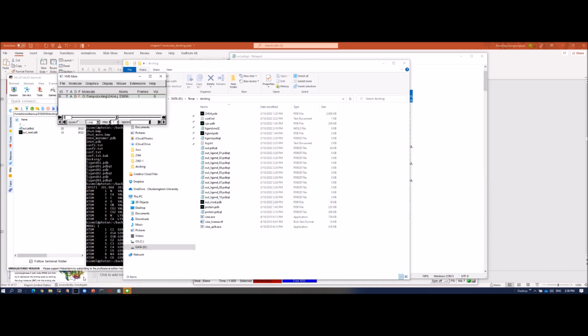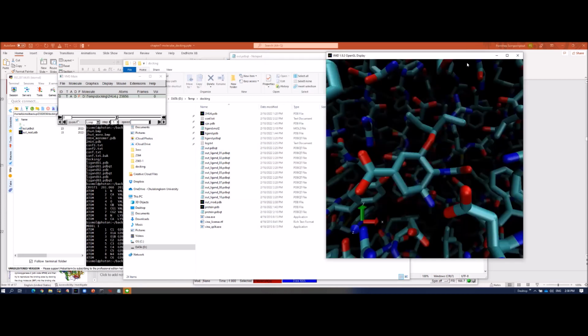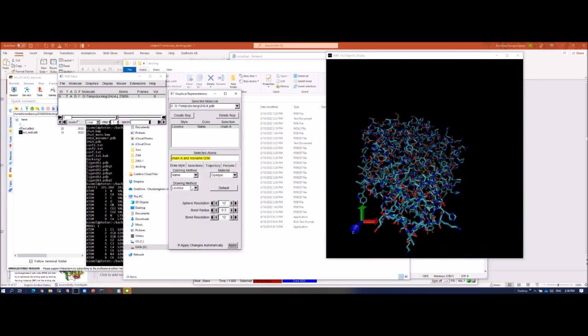Okay, let's see. So this is the reference. This is the representation, let's remove everything here.